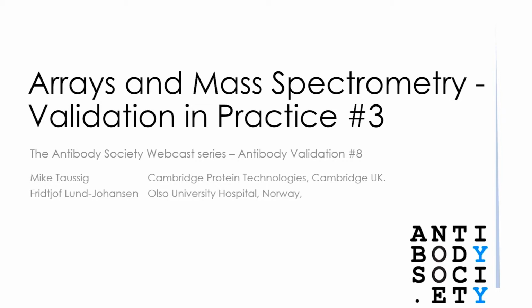I mean, in flow cytometry, you typically have a dynamic range of anywhere between 3 and 5 decades. With mass spectrometry, the dynamic range is probably higher than that, and up to 7 decades. So I don't think that quantitation is the issue here.